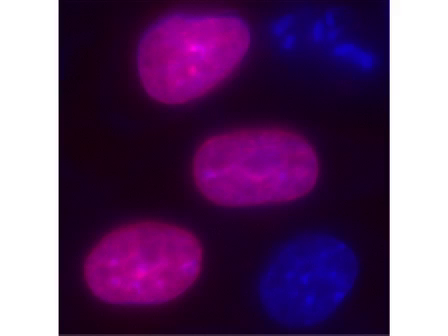Here are some representative results of fluorescent imaging using standard fluorescent microscopy of live COS7 cells that are expressing SNAP tag fusions. This first image shows live COS7 cells expressing pSNAP-H2B labeled with SNAPCELL TMR-star.